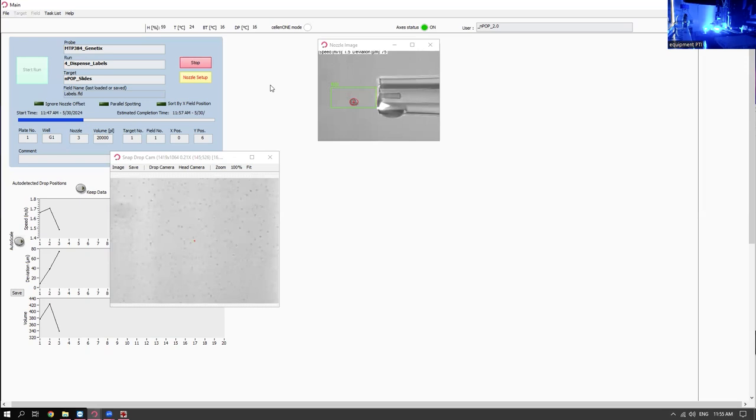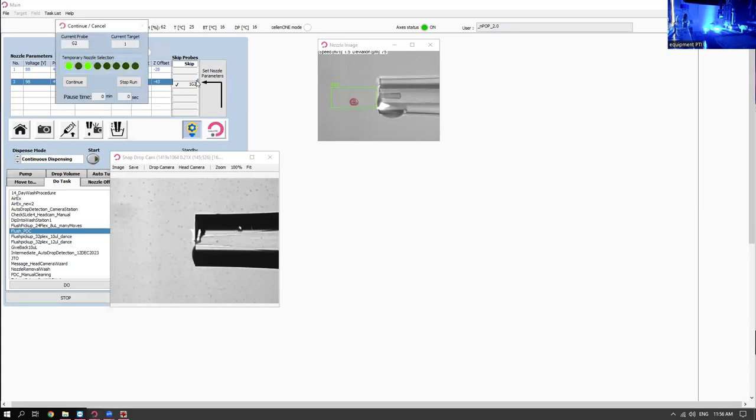So again, the 384 well plate will have flex the other day with one nozzle. Exactly. We already taught everything, so we had to do some reteaching for this 384 well plate. Yeah, and it's already there. And also, it's really nice that you have like a 29 plex that we're currently doing. And as we develop higher plex, and hopefully we get to do 109 plex, we can press this nozzle setup whenever I want.